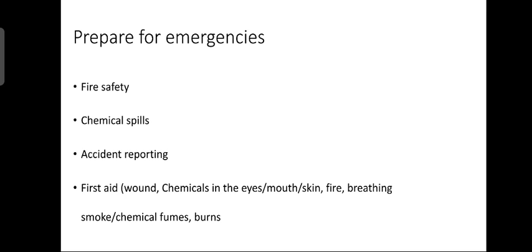Now first aid. The first aid treatment of the type of injury which is most likely to be sustained in a chemical laboratory is discussed in this. Such injuries are caused not only by chemical substances, they often consist of cuts from broken glass tube or apparatus, burns from hot pipes or steam, etc. The treatment suggested must be considered as first aid. They are not a substitute for attention by a doctor or trained nurse.